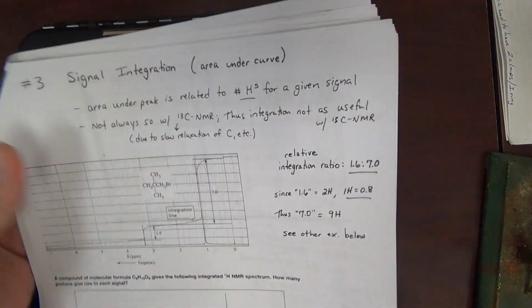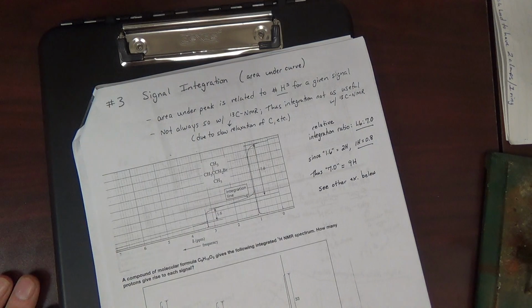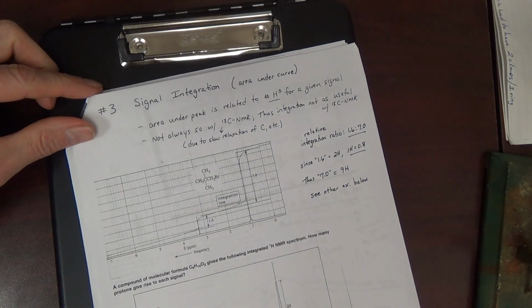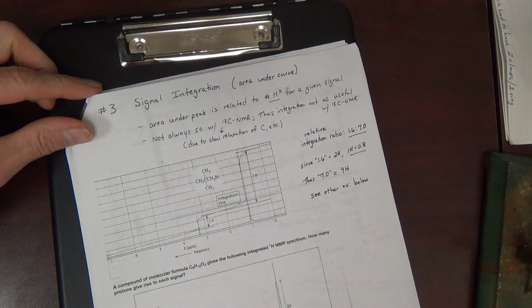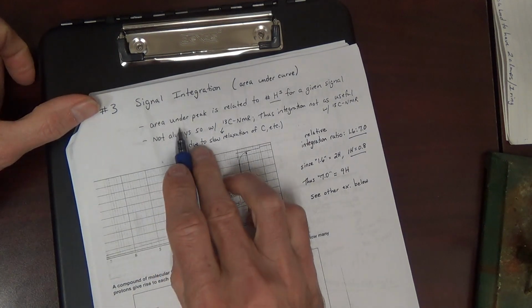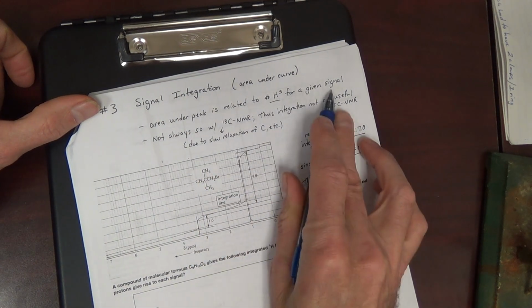Next topic or concept: signal integration. We've alluded to this before, but it turns out for proton NMR, the signal intensity correlates with the number of protons that signal is for. That is, the area under the peak is related to the number of hydrogens for a given signal.